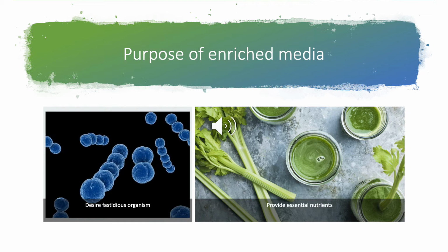What are enriched media used for? Enriched media can be used for the growth of fastidious organisms. Fastidious organisms are those that cannot create the nutrients themselves, but the nutrient is still needed in the medium in order to culture the microorganism. These nutrients would then have to be added to the enriched media to allow for the growth of the fastidious organism. Enriched media allow for the culturing of organisms that may not grow using a normal medium.